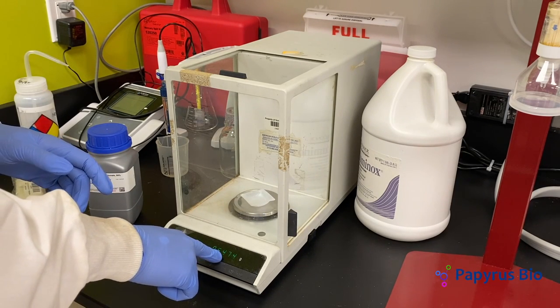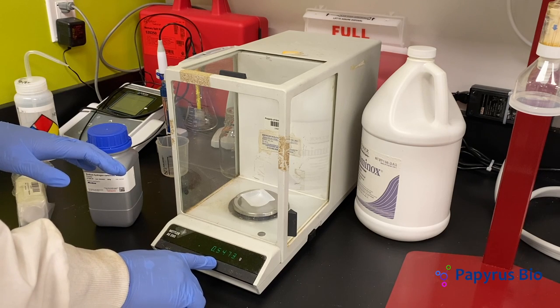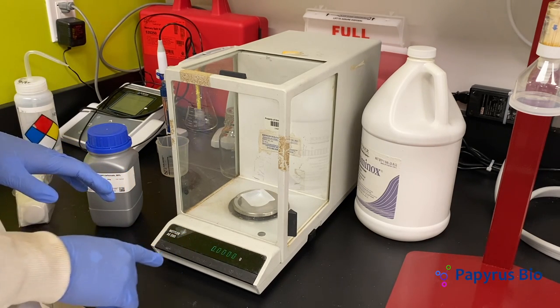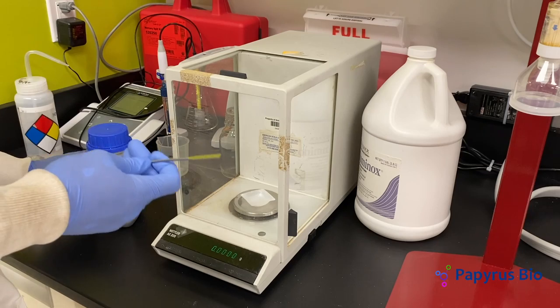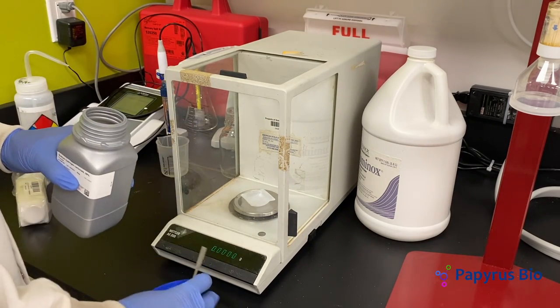We now see the mass of the weighboat. Remember to zero the scale before weighing your sample. Estimate the mass of the sample required and place it in the weighboat.